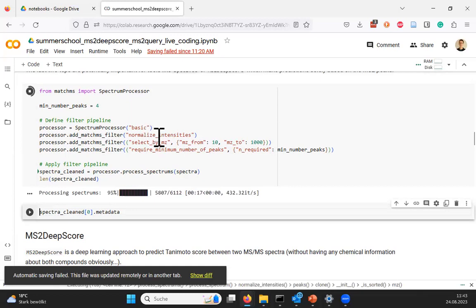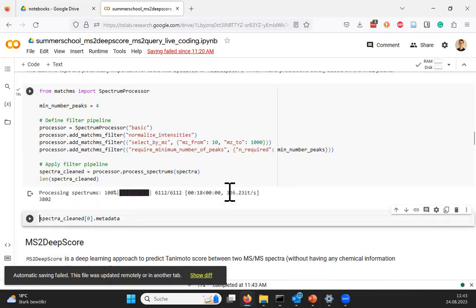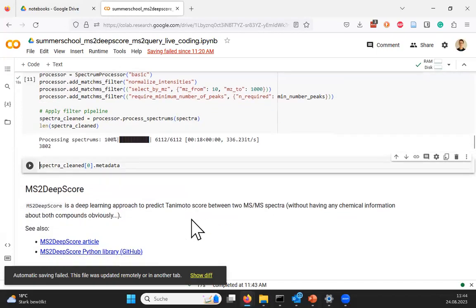Where you set the limit is not so critical, but MS2Deepscore, as we've seen before, is binning the fragments. So it only looks at the fragments, and if it gets 0 fragments, it can do nothing. With 1 fragment, it can do very little typically. So the more fragments in the spectra, roughly you can say the more patterns it can detect, if it's optimized, of course.